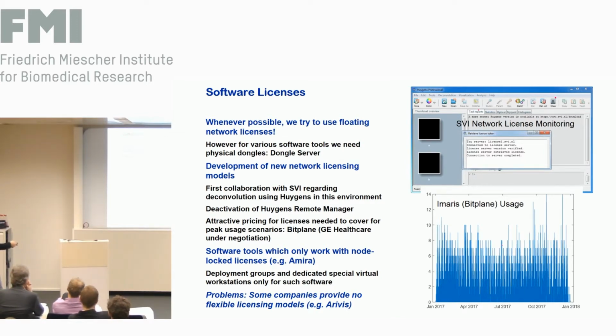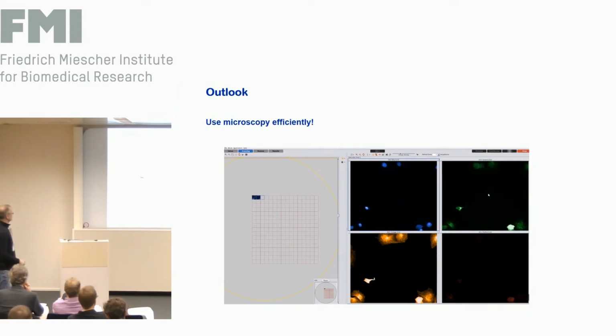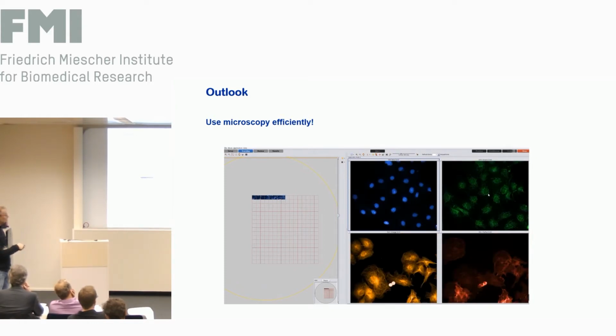Others, we are in contact with GE Healthcare. So if you want to start something new, some people really are open to this. Just to show you what is the difference. Lightsheet data has been the trigger. We realized it's not lightsheet. This is a real-time acquisition of 4 channels. You see how many images are generated here. So they are just next to each other.